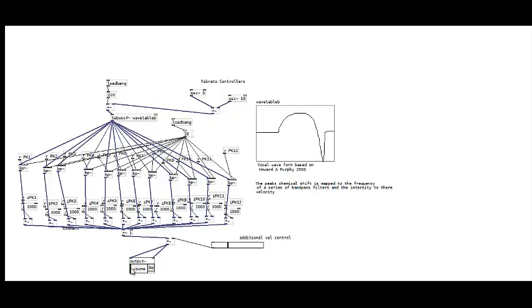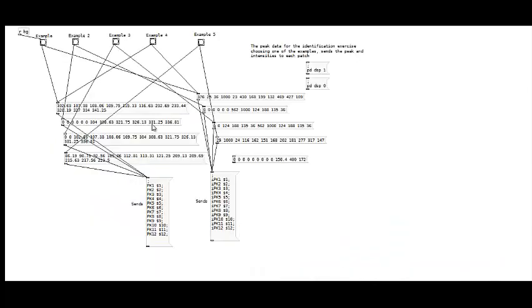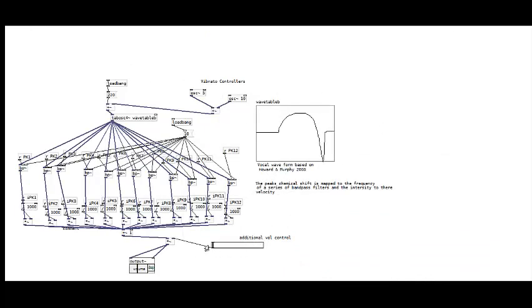So if I bring this up, this is the resulting sound from our first example of ethanol. Sounds a bit like that, and then if I bring that down, there's a slight pop when you change between these. I suggest using this control to bring it down. I'll bring it back up. Obviously the sound has changed.